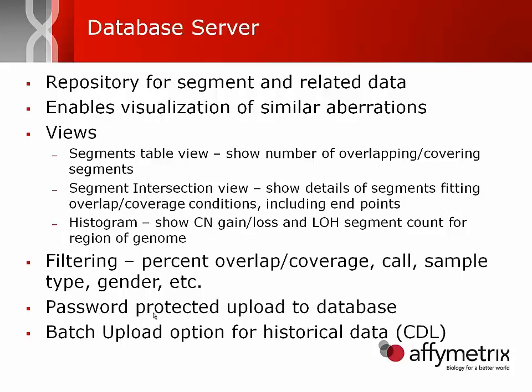I can filter based on calls, just bring me back things that are pathogenic, or I can filter based on the sample type or the gender, different annotations that we put in with the samples. The database is also password protected. You have to have a certain user role in order to upload data to the database. Anybody with a user role can query the database, but you can't actually add data to it.